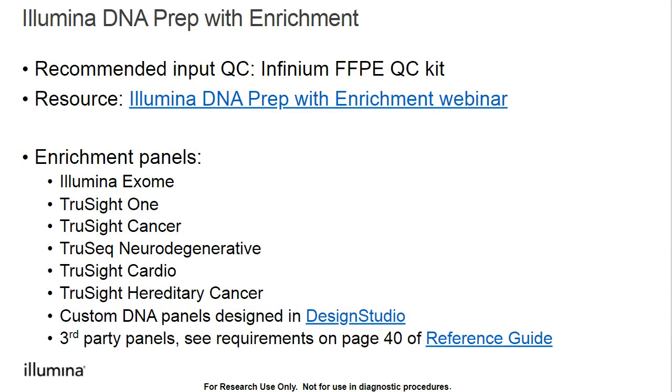So we do recommend using that qPCR or the Infinium FFPE QC kit to QC your DNA input. And then we do have a full webinar linked here just discussing Illumina DNA Prep with enrichment in depth if you wanted more information about this kit specifically.